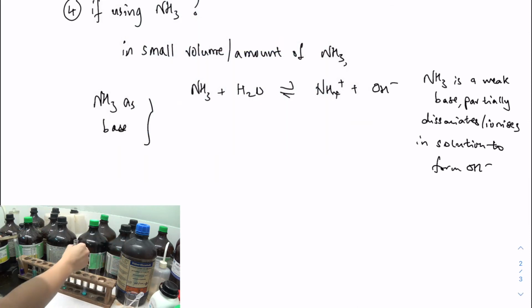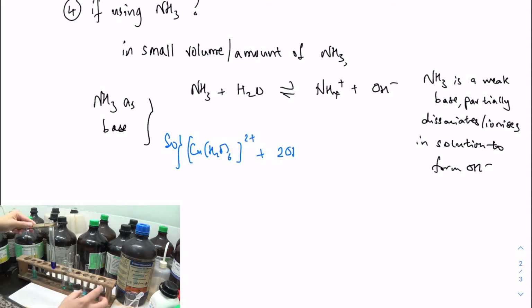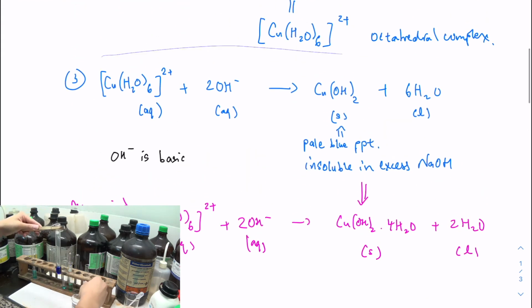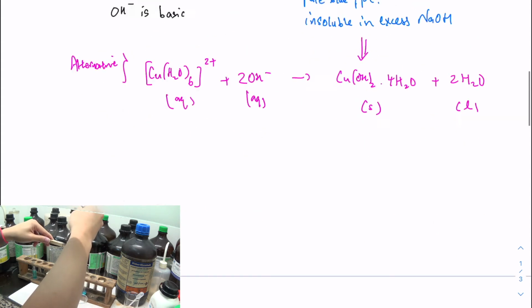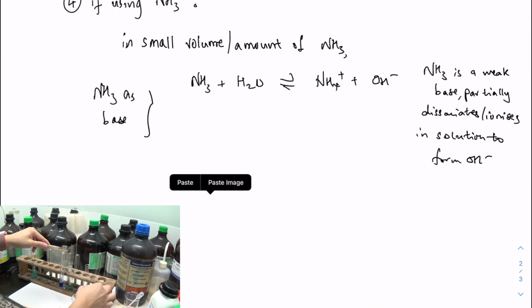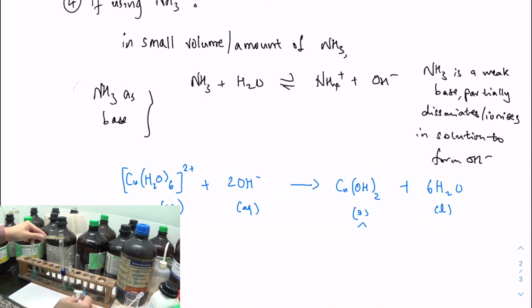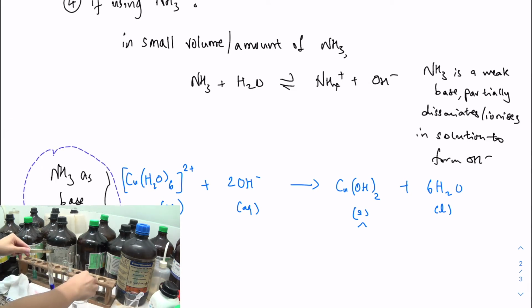So what I'll show you now is just by adding concentrated hydrochloric acid to this. This will be my source of chloride. So this is the blue color solution. So I'm adding concentrated HCl. Oops. I think I'm accidentally pouring some of this outside. So I need to be careful.